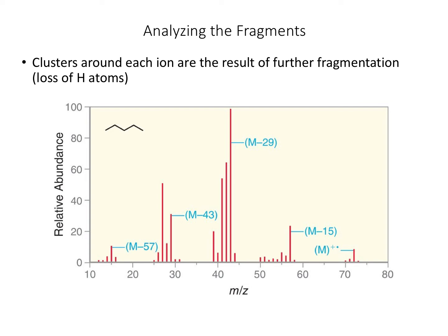And so this is just showing the mass spectrum we were kind of talking about last time. Here's the parent ion peak at 72. This peak at 57, right, when we calculate the difference between this peak and the parent ion peak, we get 15, and we say, oh, that's probably due to loss of a methyl. This M-29 is actually the base peak. That's due to the loss of an ethyl. M-43, loss of a propyl, or loss of a butyl with the M-57.